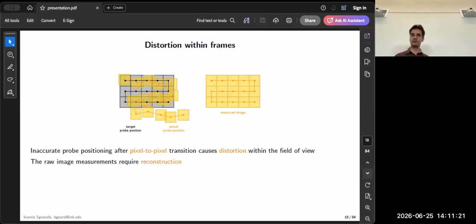Now, how do we typically solve this problem? Typically, if we suspect that our images are heavily distorted, we need to follow a certain pipeline, a certain processing scheme, very close to what we call image reconstruction and associated methods. Some of these methods are simple, some are more complicated, but what they all tend to have in common is that they are very expensive, no matter what they do. So correcting for distortion in real time is a very difficult task.